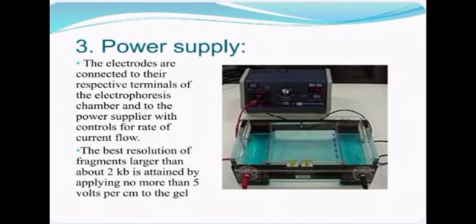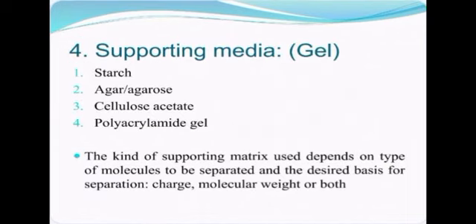The main parts of the gel electrophoresis power supply. When electric current flows, the charged particles move, migrate, and that causes separation. It is the power supply. Fourth instrument, supporting media.